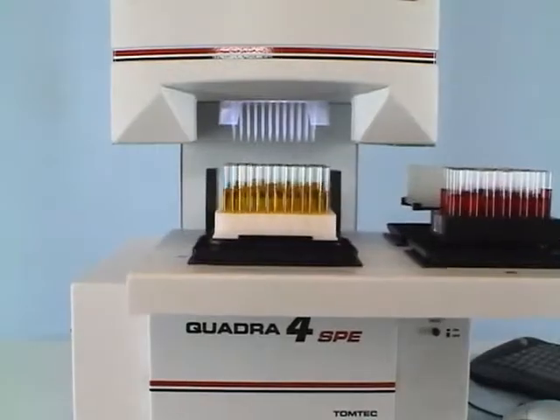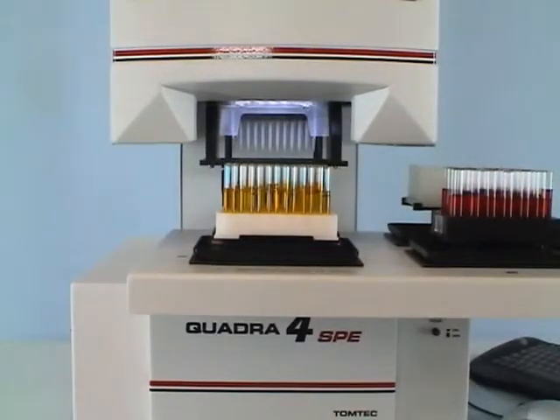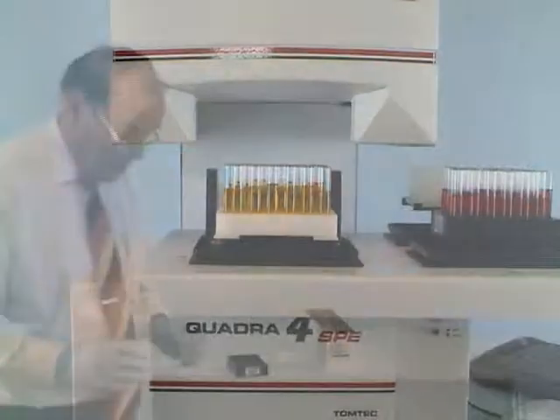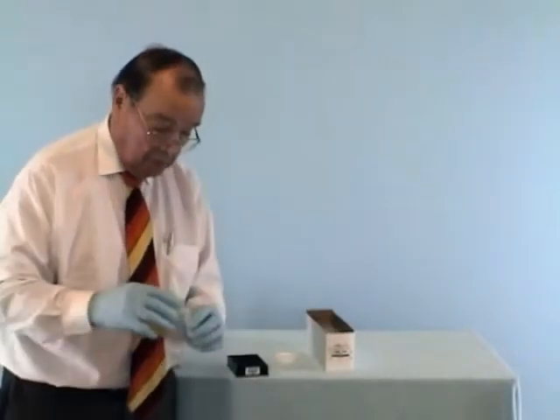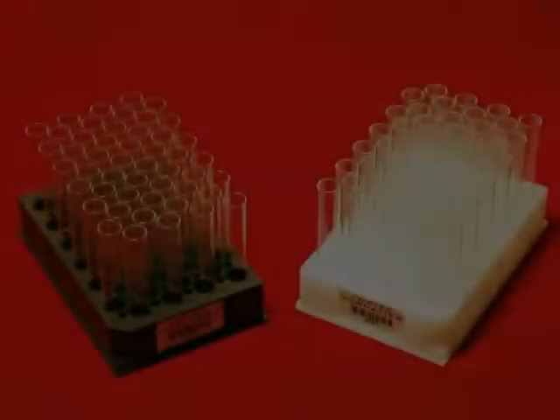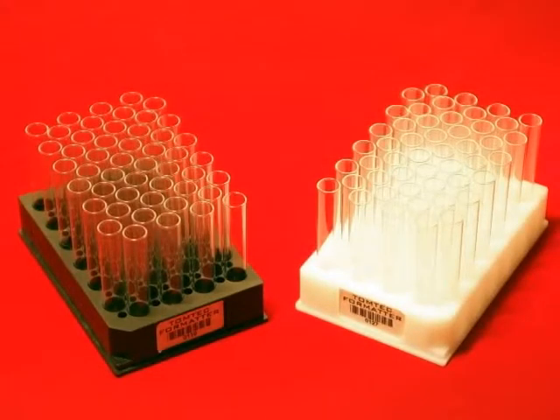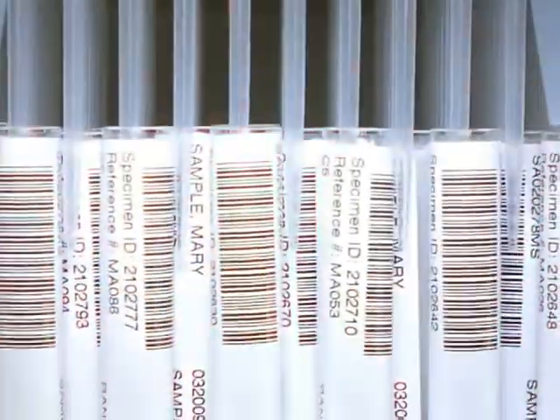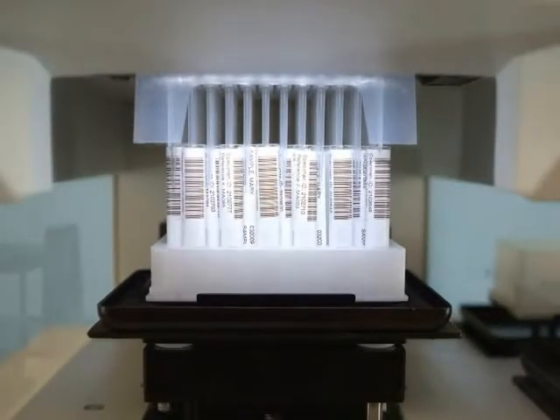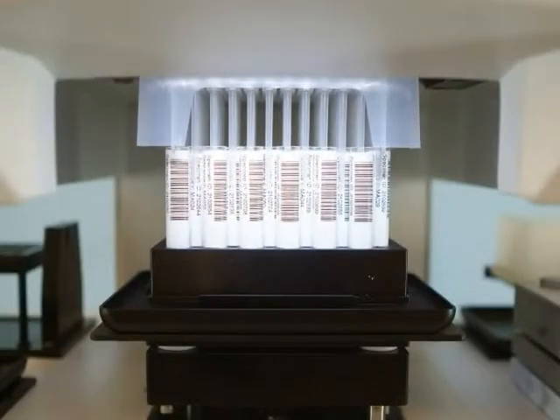How are the standards and controls put into the pattern? The same way. The standard curve, or the QC samples, can be prepared in bulk and simply poured into 12 by 75 vials, the same as the unknowns. What if you do not have 96 samples to process at one time? You simply fill the mirror racks with the number of samples you want to process. Any of the 96 tips that do not aspirate a liquid volume simply aspirate a volume of air. The same procedure is used the second time to consume any unused processing wells from the first set of samples.